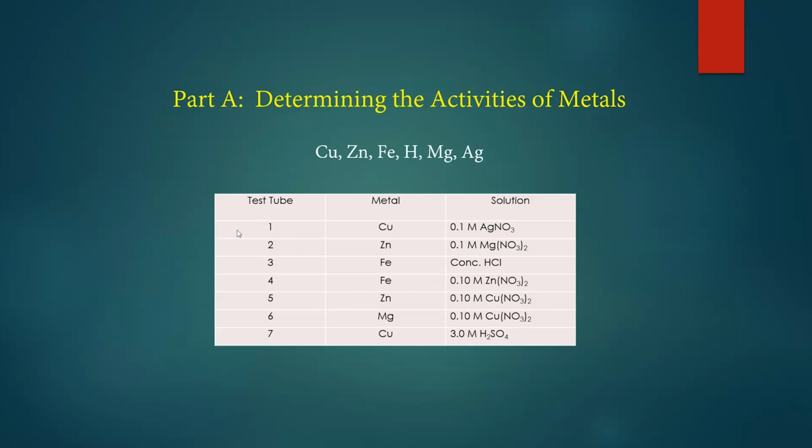So you want to make sure that you identify the correct 4 that do react and those 3 that don't. And once you've done the lab, you are welcome to check with me and make sure you have everything filled out correctly in the subsequent table.